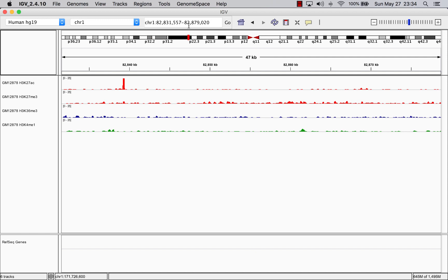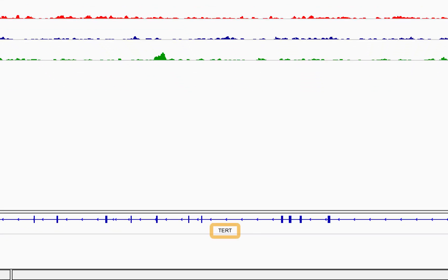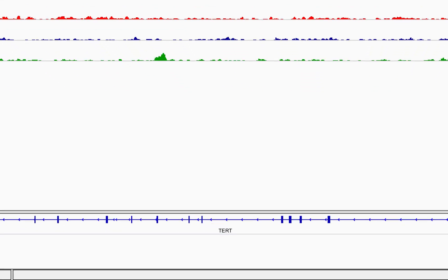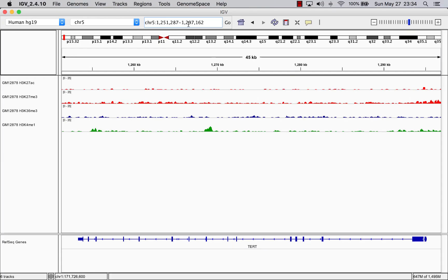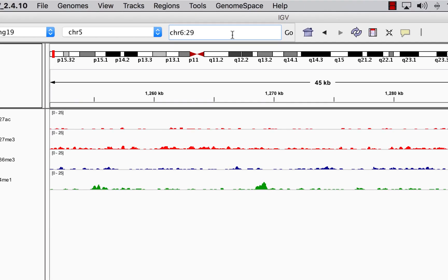And if you have a specific gene in mind, you can enter it in the search box to be brought there. You can also search for a particular region by entering genomic coordinates.